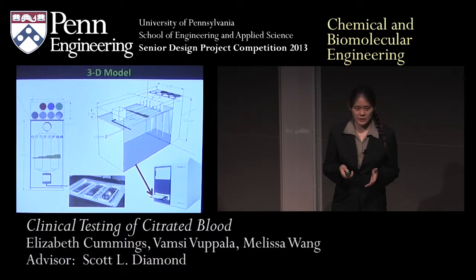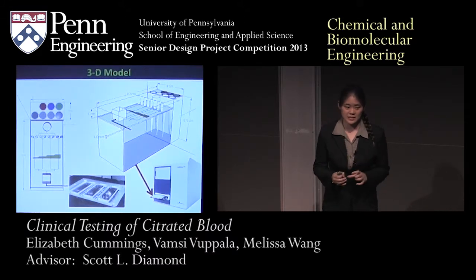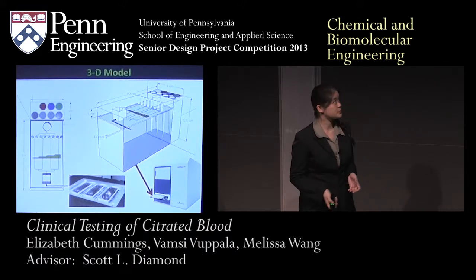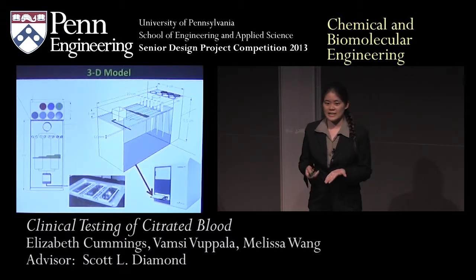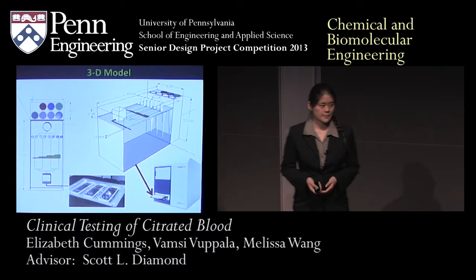Microfluidics is the manipulation and control of fluids at a sub-milliliter scale, and the idea is to use this technology to create these small-scale devices in order to replace what are traditionally off-site and slow tests. Our microfluidic chip is made up of a layer of polydimethylsiloxane that has been patterned with the microfluidic channels. Underneath is a glass slide that has been layered with the 4 clotting surfaces. Vamsi will now be passing around some of the devices that we used during our lab test.